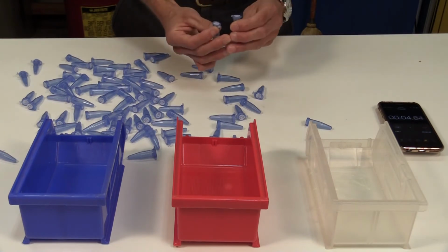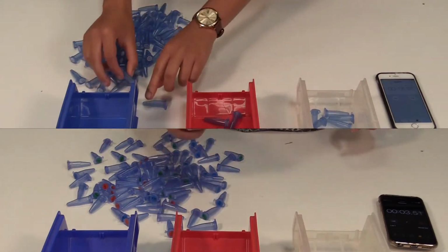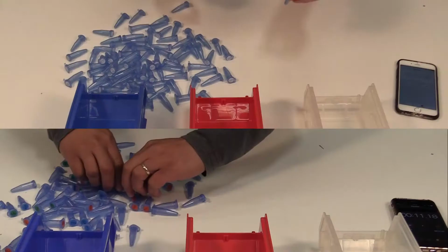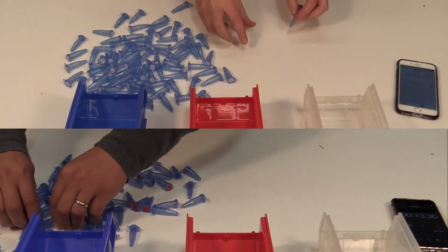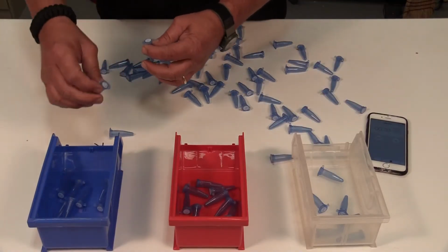As a control, we alternated which set our participants sorted first and gave them minimal background on the purpose of the experiment. After we were finished, we pooled together the data to see what we could learn. On average, participants sorted the color-coded set 35% quicker.